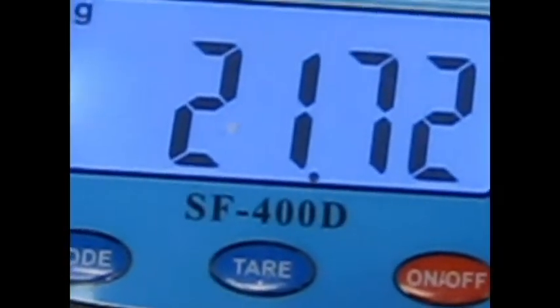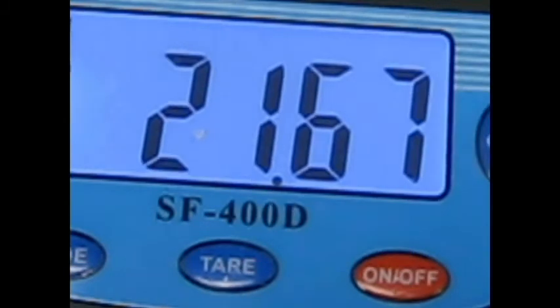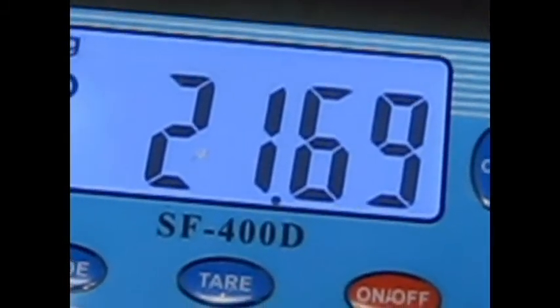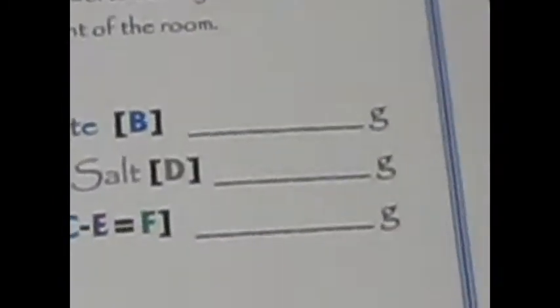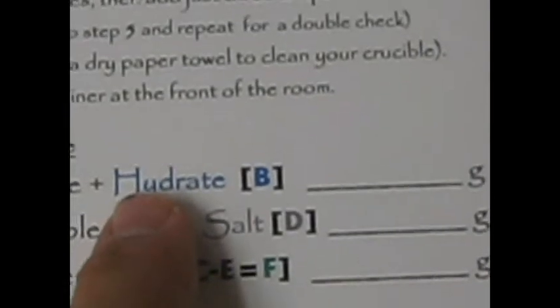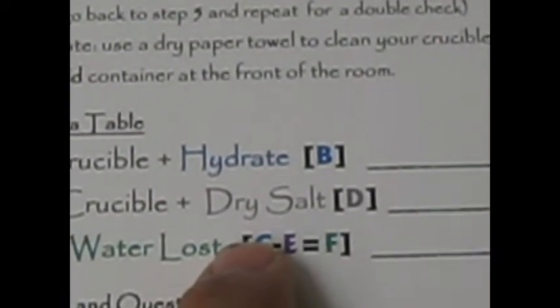That's the dry salt. There's very little blue in there. Very, very little blue. 21.67. Sometimes you have to wait for it to settle at 21.69. That is what goes right here. Okay? And then, if that was the hydrate and that was the dry salt, I'm sorry.